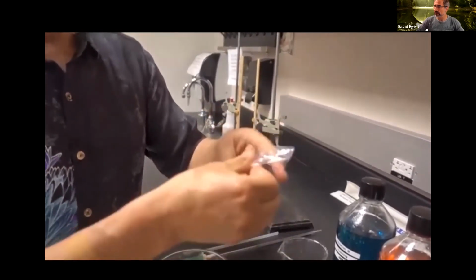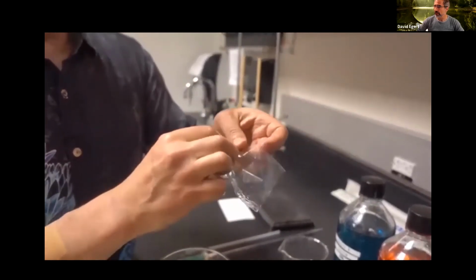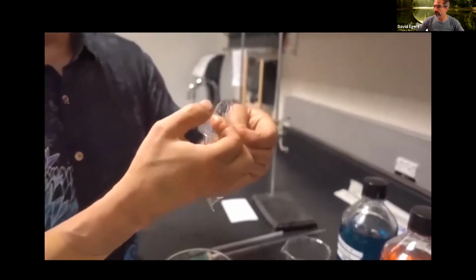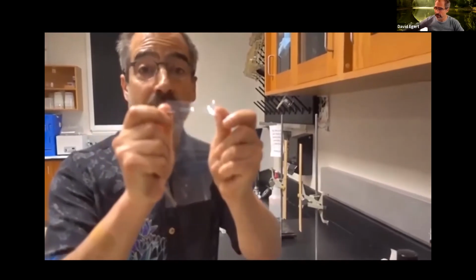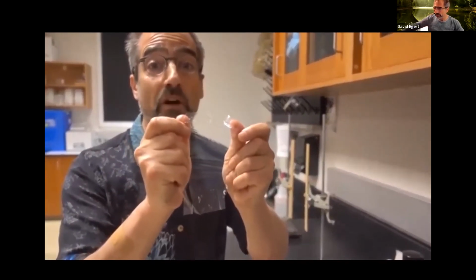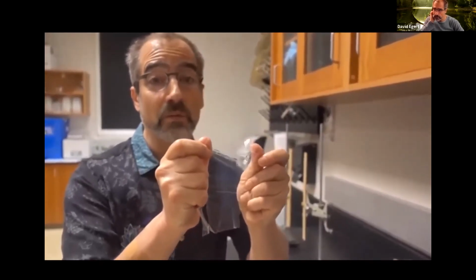Basically now I have a sheet of this dialysis membrane. It's basically a plastic that has tiny little pores in it that will allow water to freely pass, but will block the passage of large molecules such as sucrose, which is the thing we're looking at today.